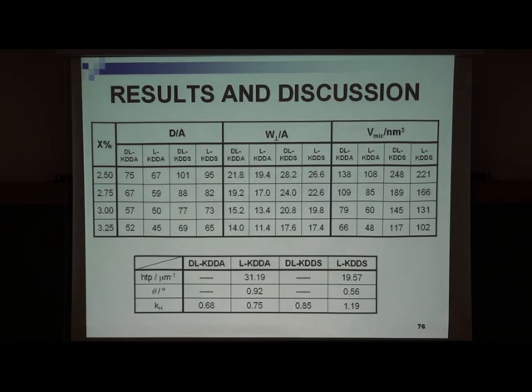So I summarized some important results for you here in this table. As the concentration of the amphiphilic molecules increased in alanine and serine systems, the distance between the chiral micelles in alanine and serine systems gets smaller.